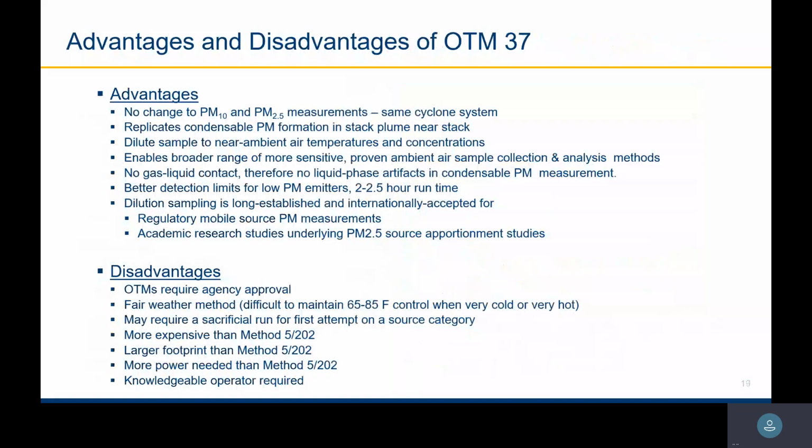And then the biggest thing is you really have to have someone with some experience in it because of those method detection limits. If someone were to obtain the equipment and just test it out in their backyard, they could get that experience. They could use it for a month or two and get that experience.